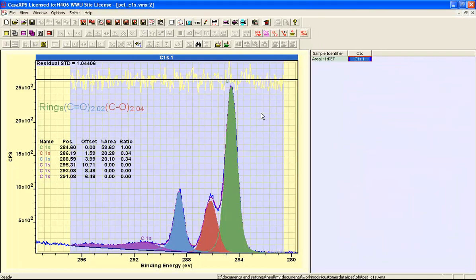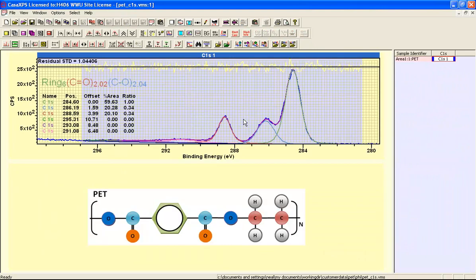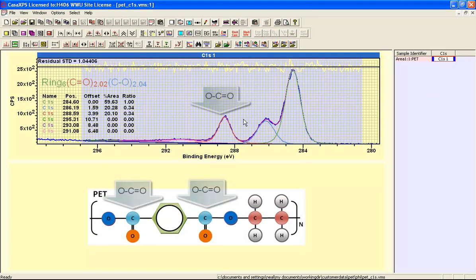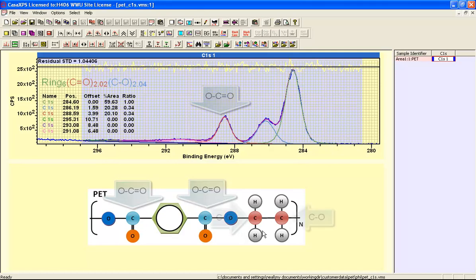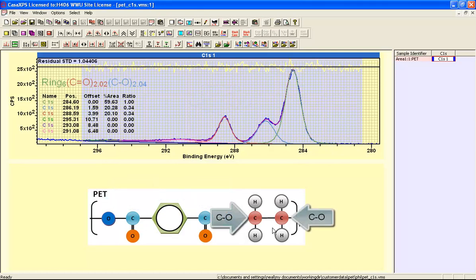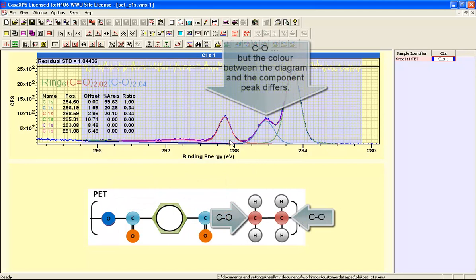This mechanism for coloring components is useful when you've got some situations such as this, where we have a polymer and we would like to indicate the relationship between these various carbon atoms and the peaks we see by XPS.